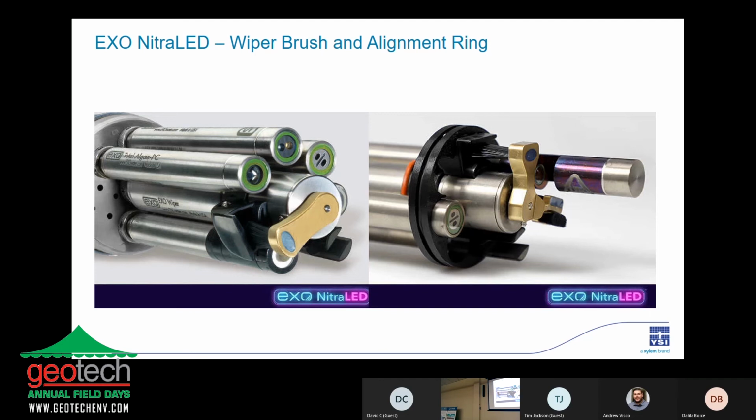So it's a hybrid, right? We were able to use that old high torque motor with a really reliable wiper and add another wiper on there and get a little bit more enhanced wiping for this new sensor and the same quality of wipe that you're seeing there.